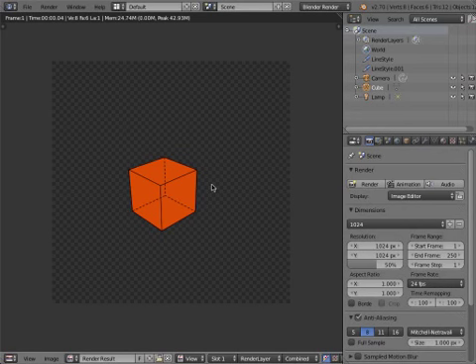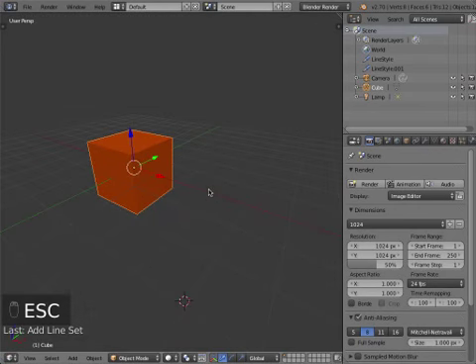And you're not going to see any ambient occlusion because there are no concave areas in the model that we had here, so there's nothing that's being occluded, and that's why I don't see any shading based on that.